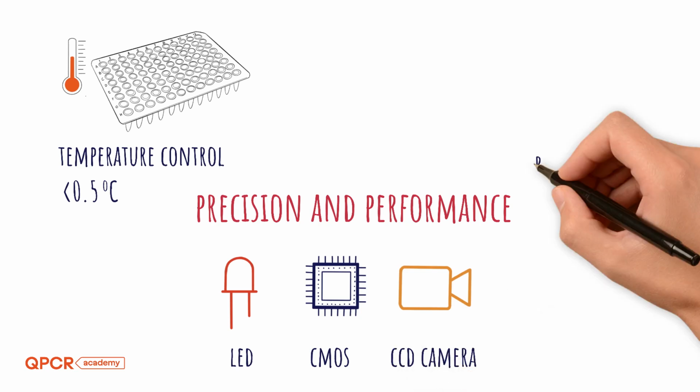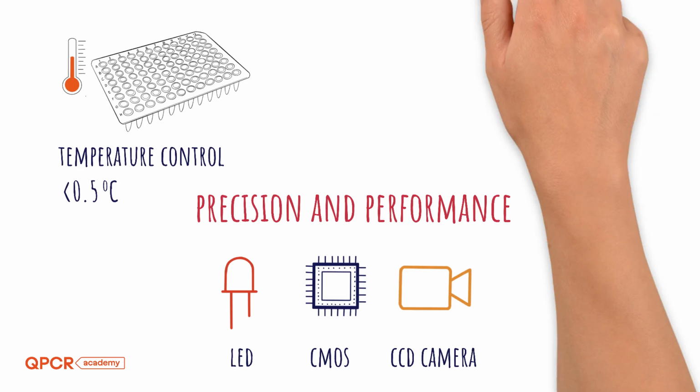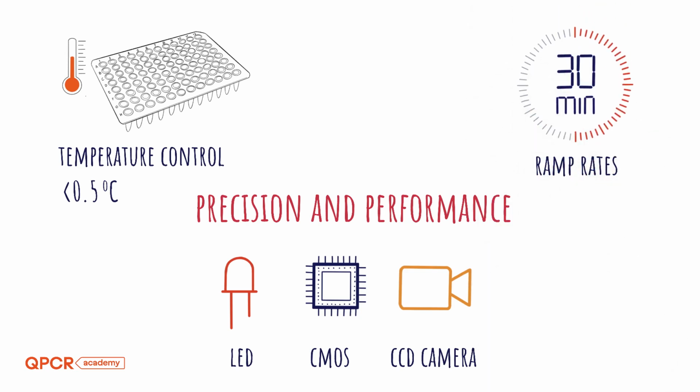And don't overlook ramp rates. Faster heating and cooling cycles can cut run times dramatically. Some modern systems finish a full run in under 30 minutes without compromising quality.